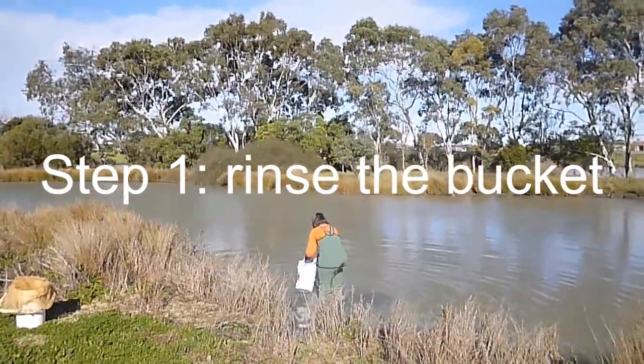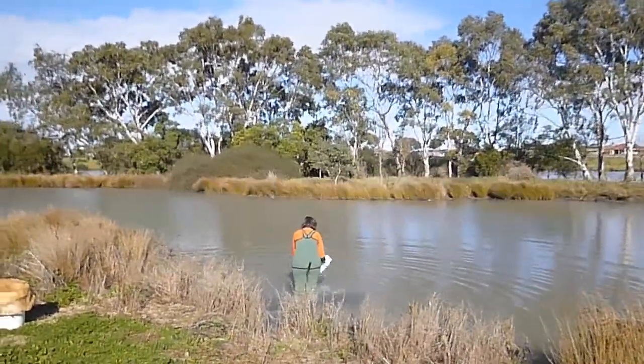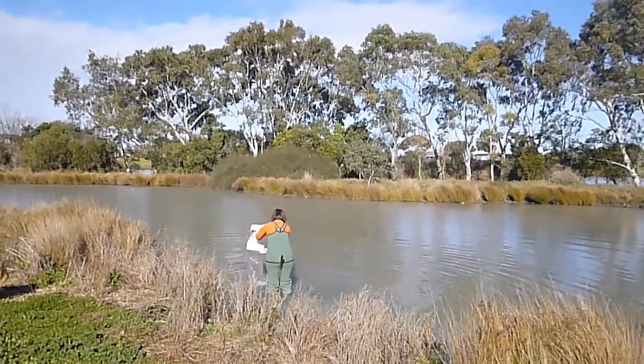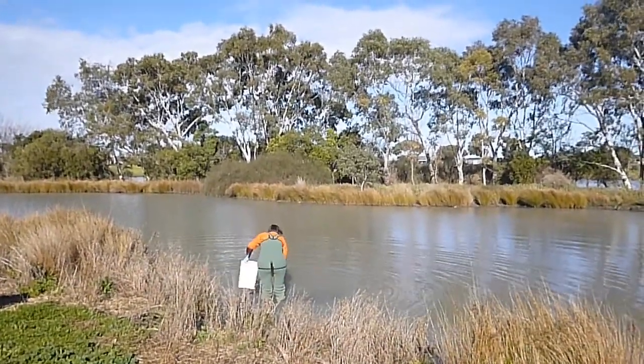Then you'll need to get into the water and rinse the bucket to get rid of any residue retained on the bucket from previous sampling. Rinse it out a couple of times in the water on site.